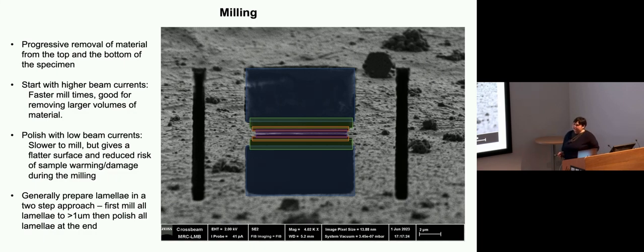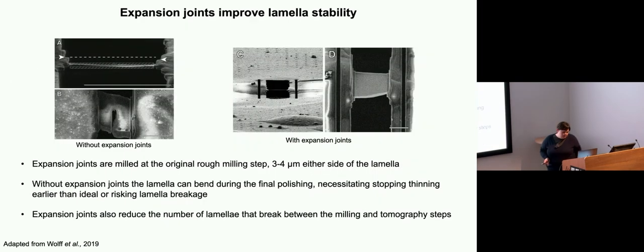You don't have to warm them up, obviously. Some of you may have also noticed these vertical cuts either side of my lamellae. These are what we call micro expansion joints. These really help with lamella stability and help prevent breakage. This is an example from this paper where these were first proposed. When you're milling, sometimes the lamellae bend up a bit or break and you end up with the front broken.